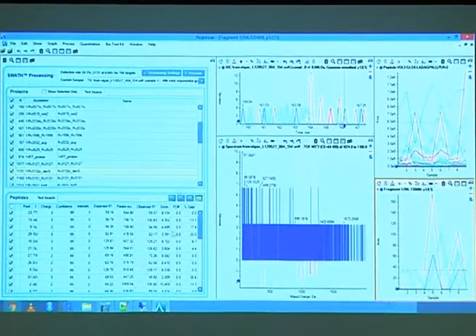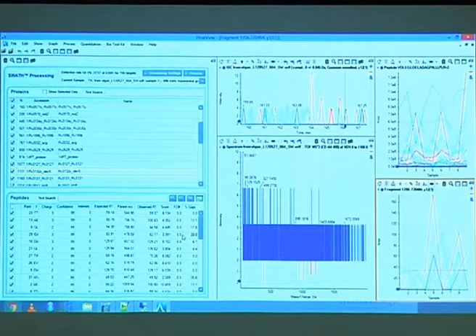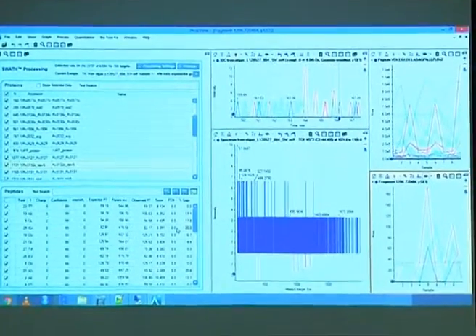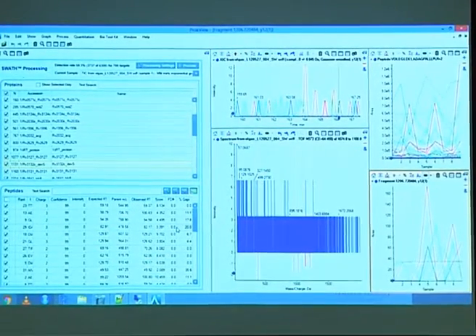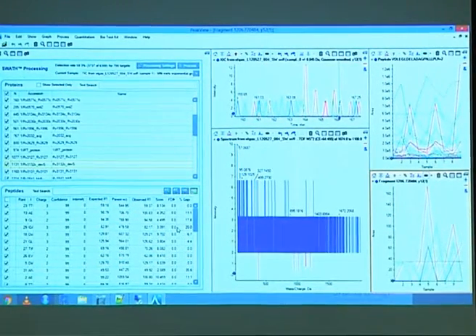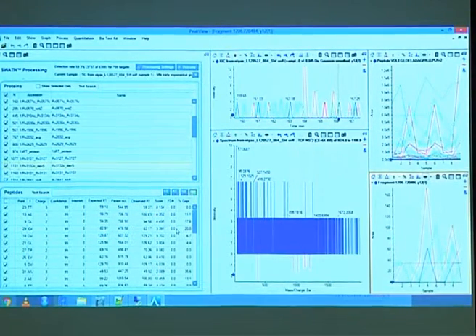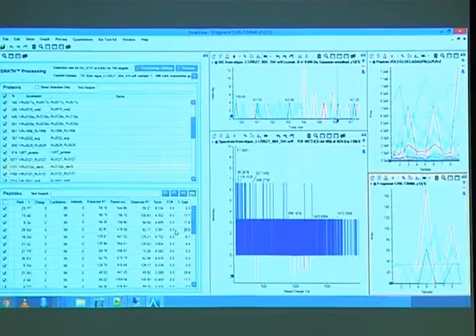The reason for this is that this number here, that FDR value, is actually not properly calculated. I only had about 300 assays in here, which for a 3-hour gradient means in terms of decoys, you have about 2 every minute. That's not that much. You should have about 100 for 10 minutes, so about 5 times more at least.